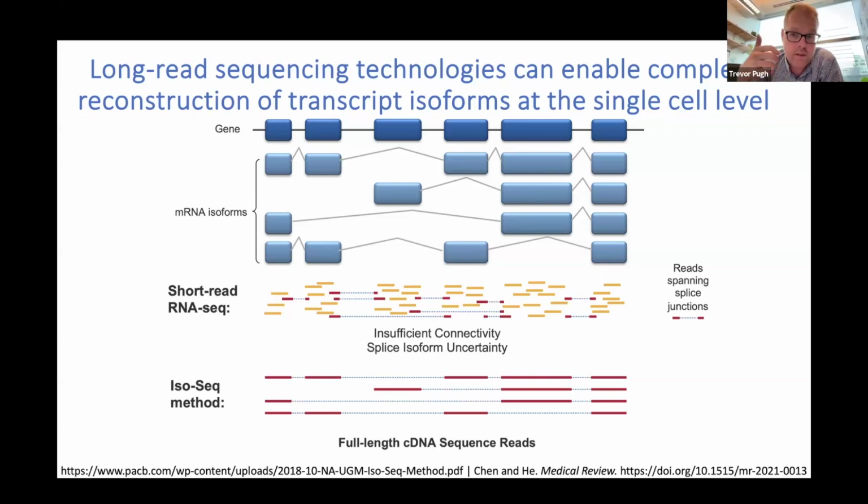So exactly, if you're very interested in precise mapping of splice variants, then you want to marry that upfront full-length transcript amplification technology with a downstream full-length sequencing technology as well. You can think of those two steps in single-cell analysis as relatively modular. Great question. Does that answer what that individual had in mind? Okay, hearing none, I will push on.